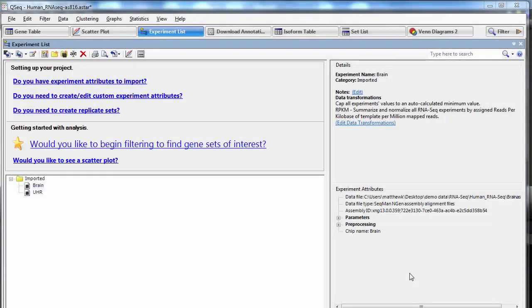Array Star allows you to easily identify and compare interesting groups of genes, snips, isoforms, exons, and other items, depending on what kind of project you're working on.